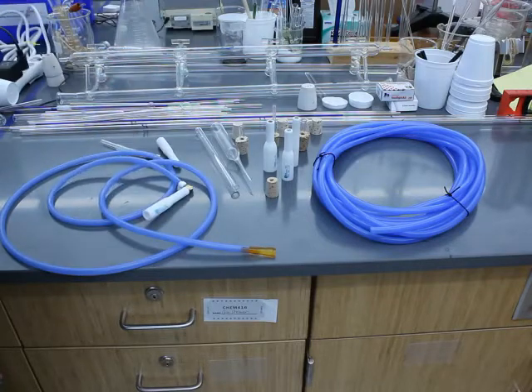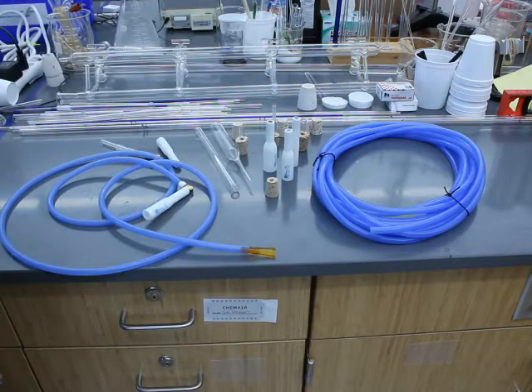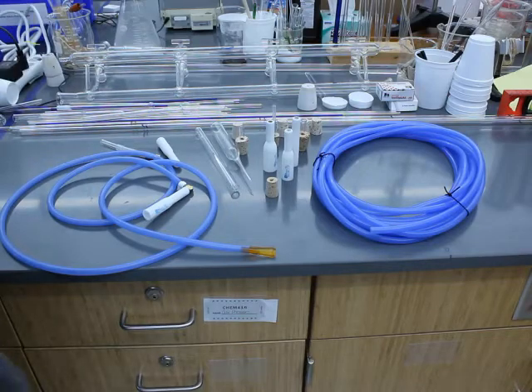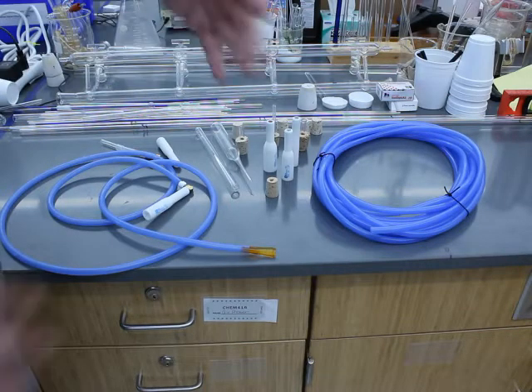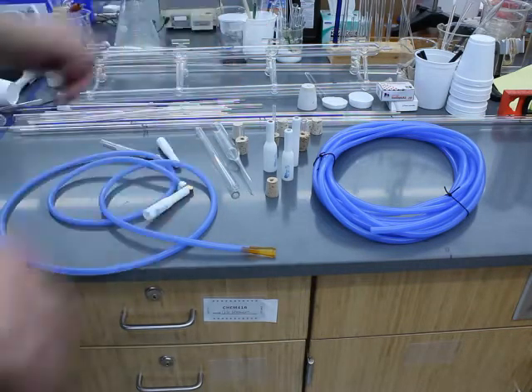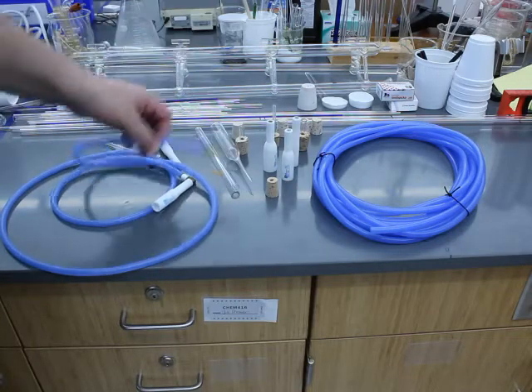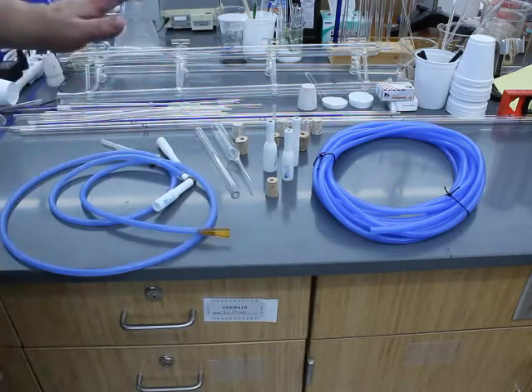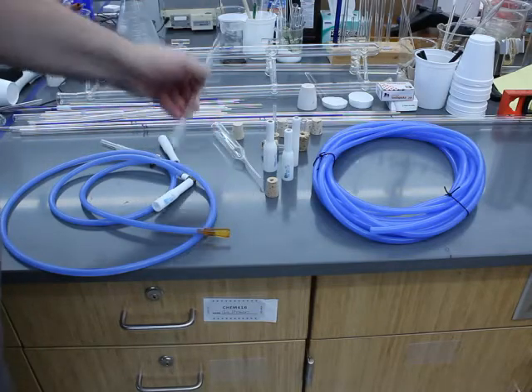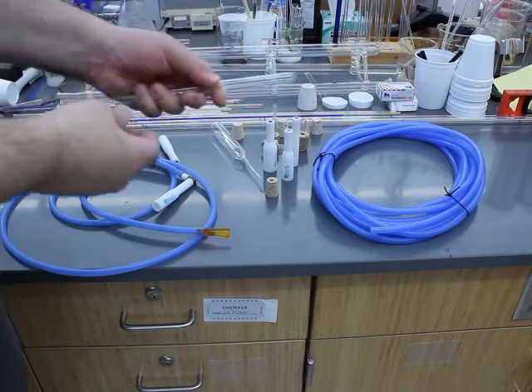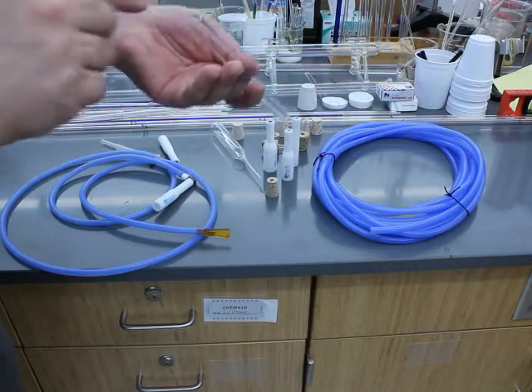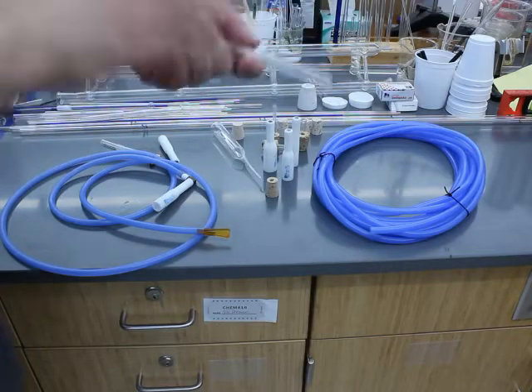You're looking at maybe $20, $30 total, which is really overpriced if you buy kind of a pre-made package of a blow hose and adapter and the like. But it is worth it because when you're working with the blow hose, it gives you a lot more control than if you're simply putting your mouth to the glass and blowing it.